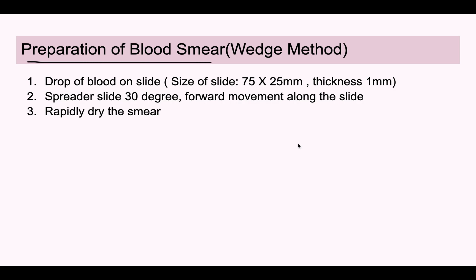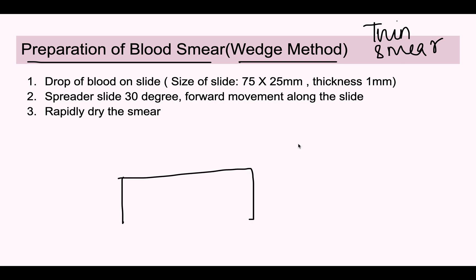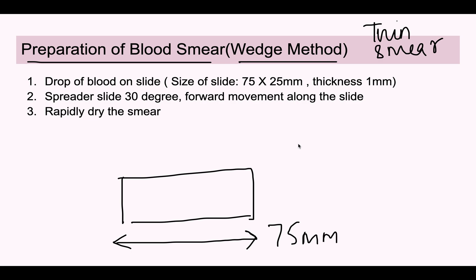We will prepare the blood smear using the wedge method. We are talking about a thin smear here — there are thin smears and thick smears, but we are discussing only the thin smear. We take a drop of blood on the slide. The slide dimensions are important: 75 mm × 25 mm with a thickness of 1 mm. We place a drop of blood on the slide — it should not be too large or too small.